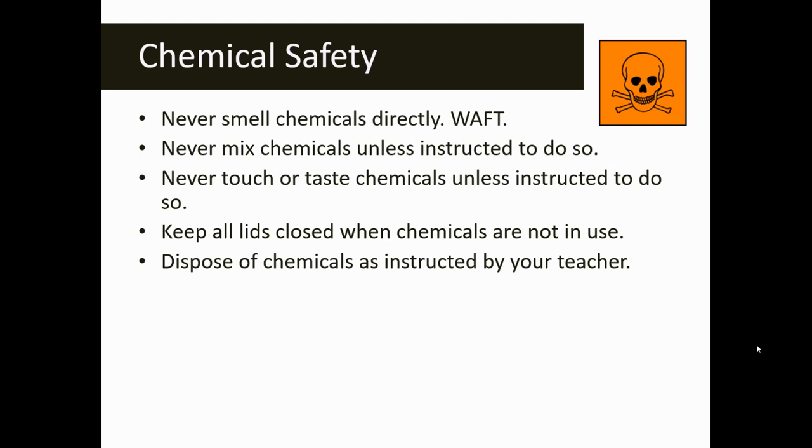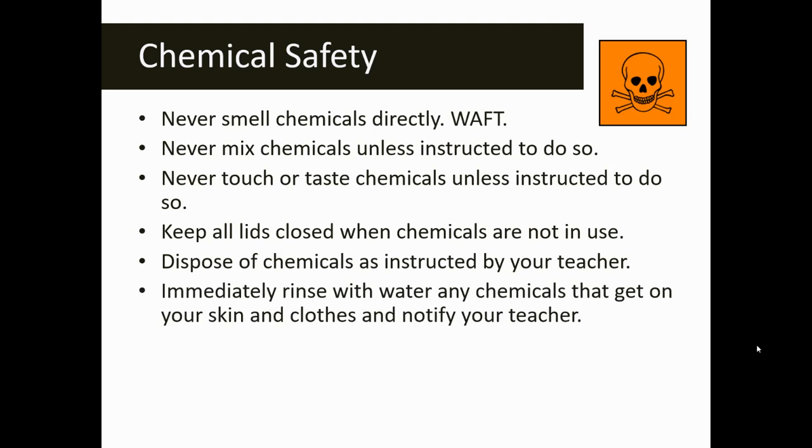Dispose of chemicals as instructed by your teacher — you can't assume that chemicals can be poured down the sink, down the drain, or placed in the trash can. If you get any chemical on your skin, rinse it off immediately and notify your teacher. This applies to anything that happens in the lab — if you get a chemical on your skin or eyes, or get cut, don't be afraid to tell your teacher. Even if you think you'll get in trouble, always tell your teacher because there's documentation we need to complete to make sure you get proper assistance.